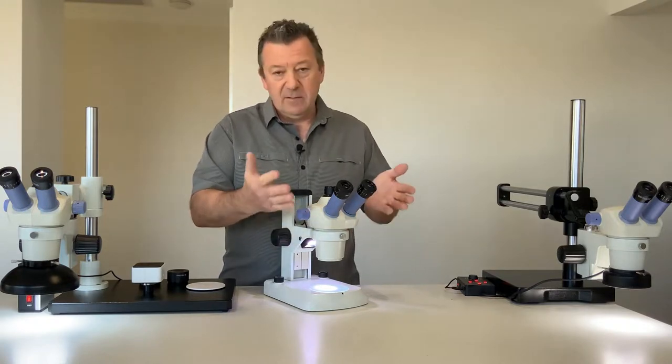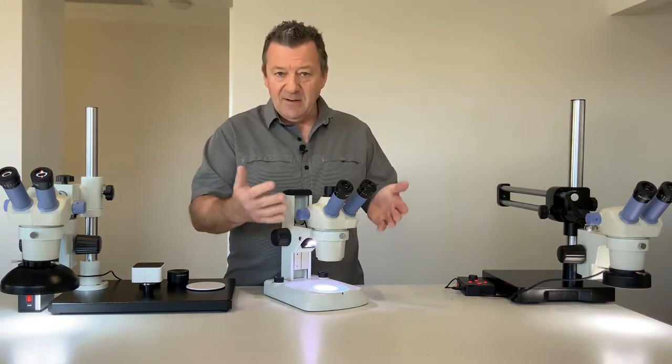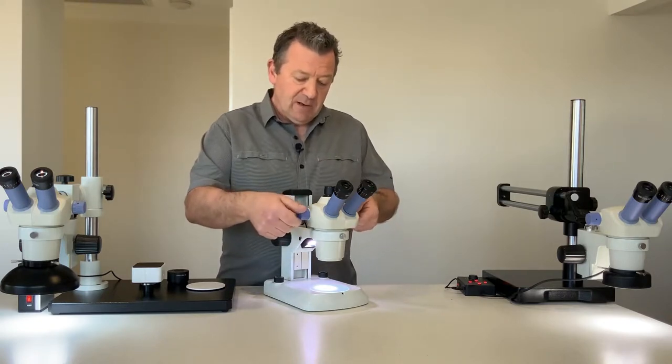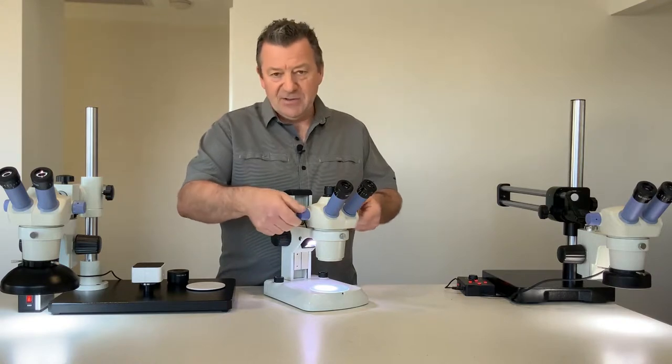So you get a magnification range of 10 all the way to 45 times. This is controlled by the zooming knobs here.